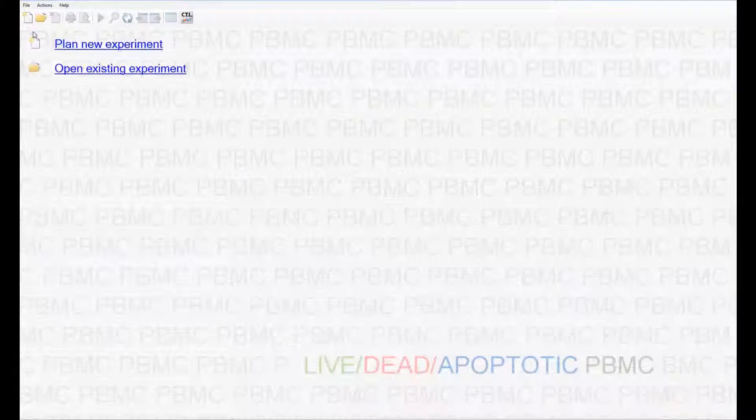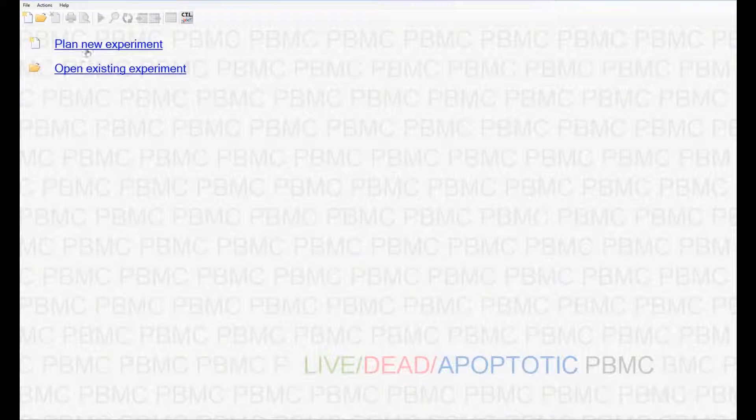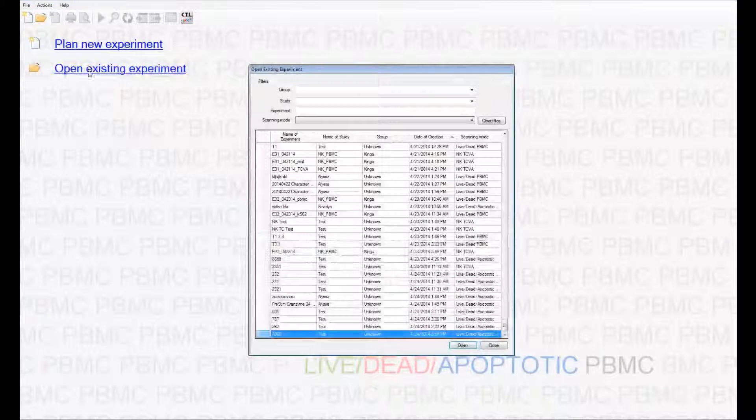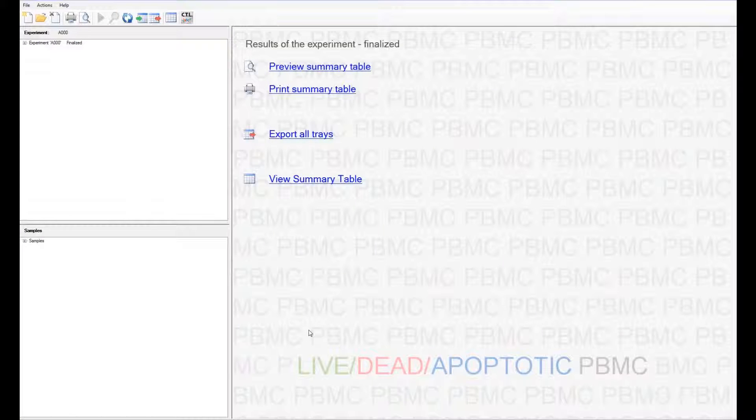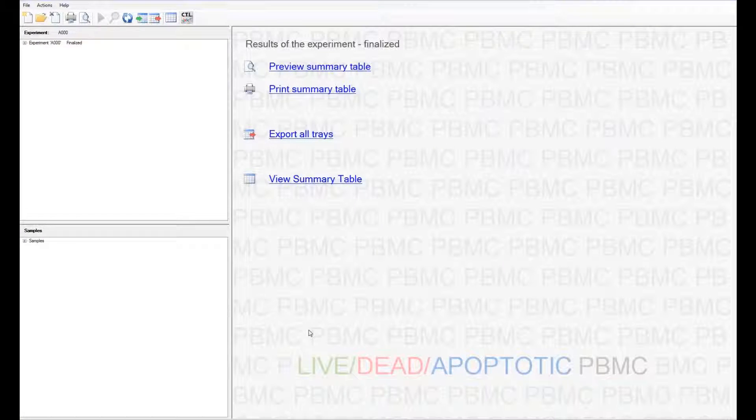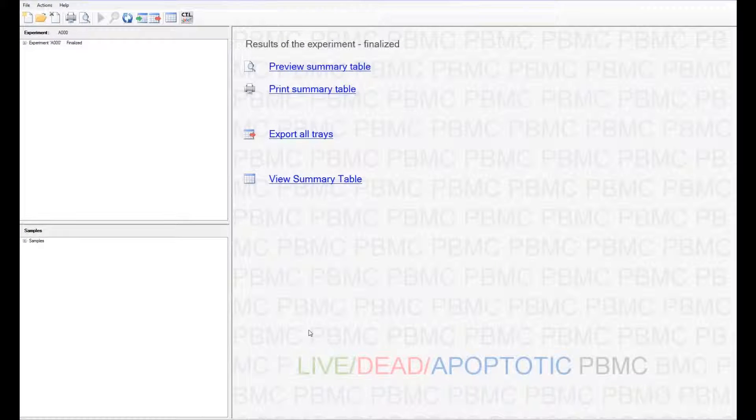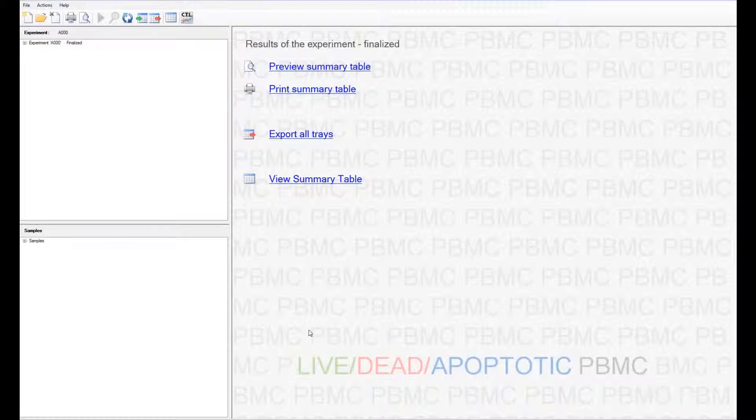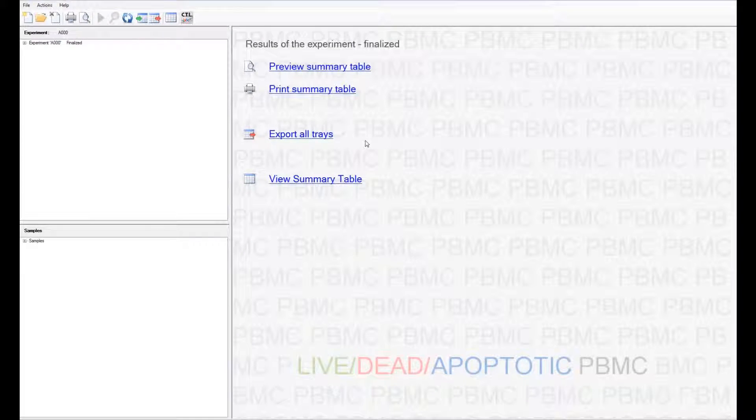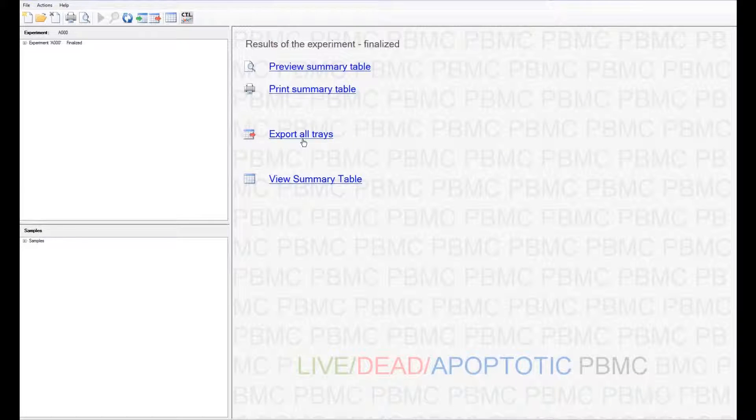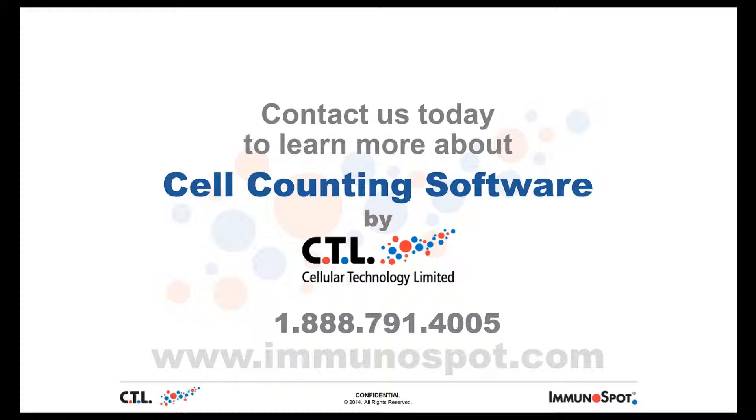Just before we end, I would like to show you what opening an experiment does. Since we just created and analyzed an experiment, when we open it again, this allows us to do everything I just mentioned a little bit ago, from counting more samples to viewing and exporting our data.